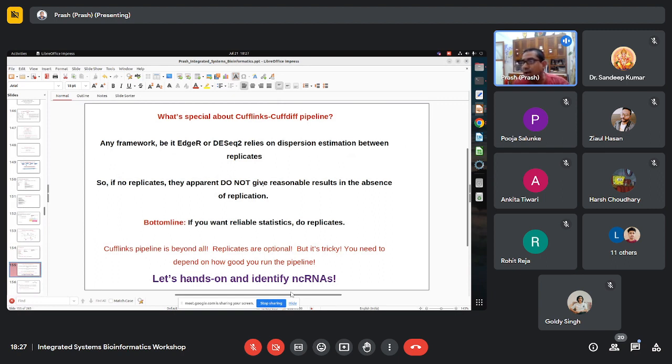So which means you'll have, say, sample1.sam, sample1a.sam, sample1b.sam. Those are all the individualized samples across those replicates. So if there are no replicates, absolutely, maybe DESeq or EdgeR, that Bayesian way of dispersion approach is nullified.